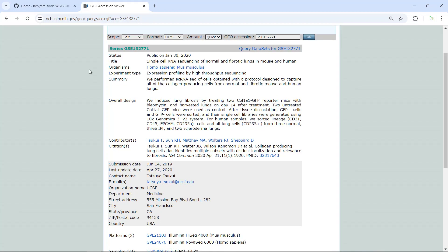Hello everyone. Welcome back to my video tutorials for single-cell RNA sequencing data analysis. Today I'm going to show you how to use the SRA toolkit to download the sequencing data from NCBI. I'm going to use the GSE132771 dataset for the demonstration.